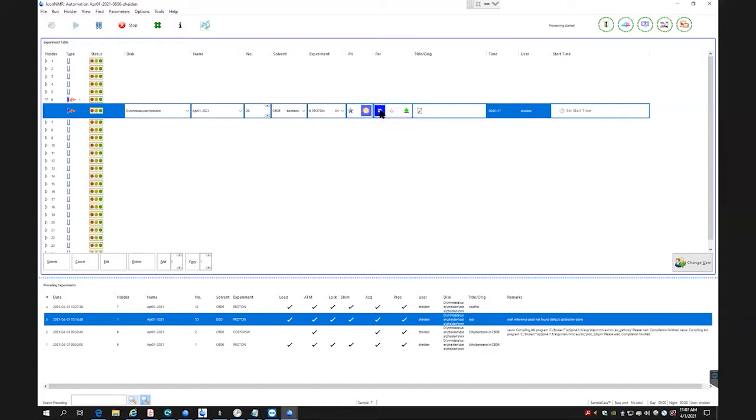The next one, where the equals are, these help set up parameters. Your options will have number of scans, O1P, which is the offset frequency, and sweep width. You may also have a delay of D1 or other ones if you request those, but right now the defaults are the first 3, possibly 4, depending on what your requests are. The first one, NS, is number of scans, so this is the number of times it'll scan the spectrum. The default is usually 16 for proton. If you want more, you can simply type it in and say 32.